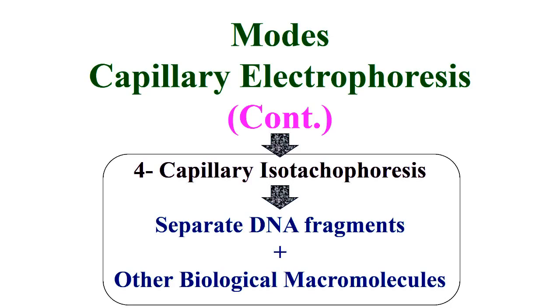Capillary Isotachophoresis. Separate DNA fragments and other biological macromolecules, based on electrophoretic mobility, as mentioned in the next slide.